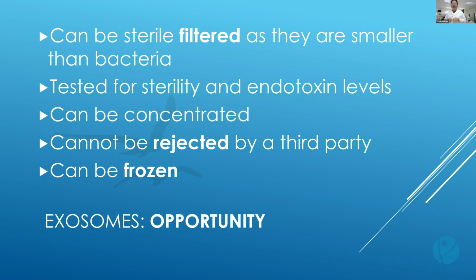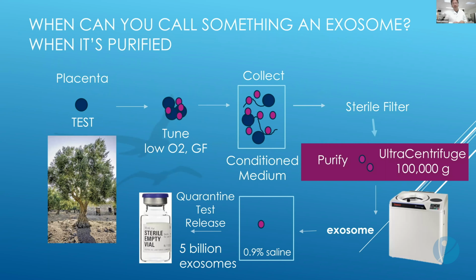I just yesterday looked at a sample of an exosome that we looked at 3 months ago. We left it at 4 degrees Celsius for a month, and then we looked at it just now on this microscope, and it's completely fallen apart. So you will want to use that exosome in a period of about a day after thawing it. But it's really fun to be able to actually see that. So this is our method and how we do this.